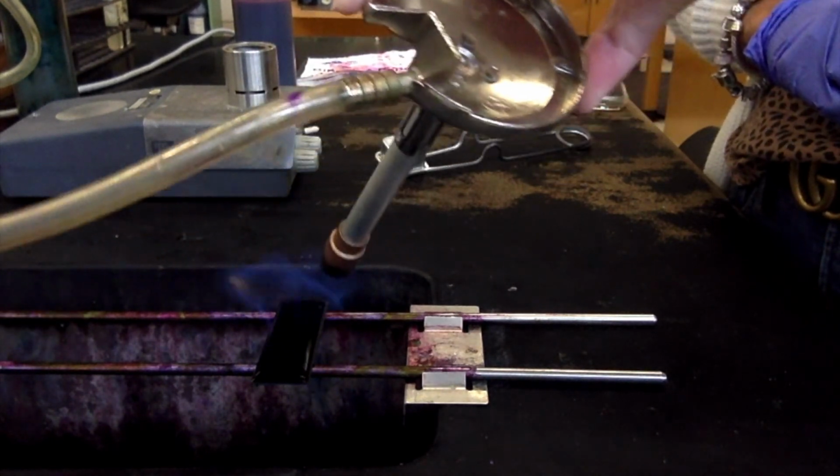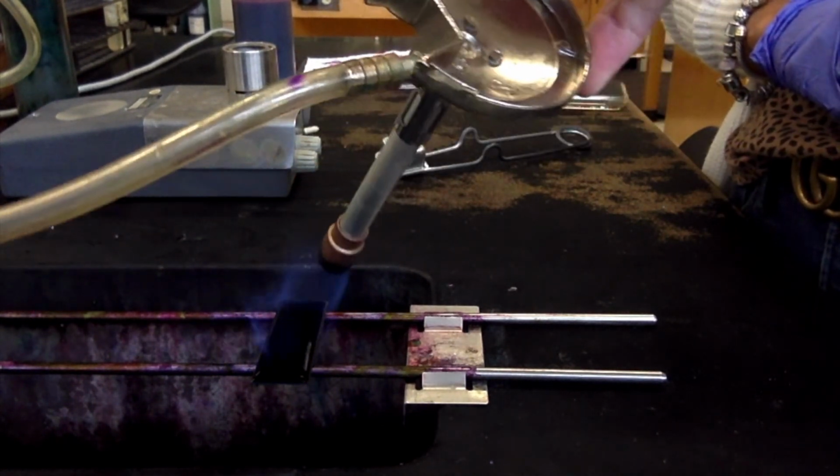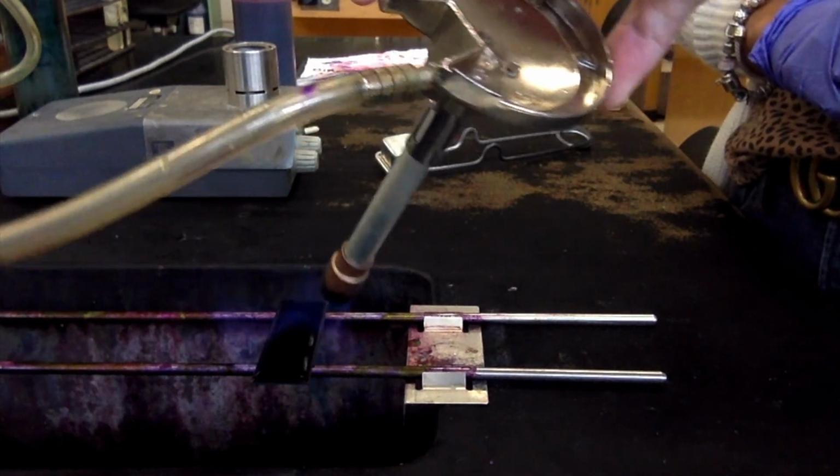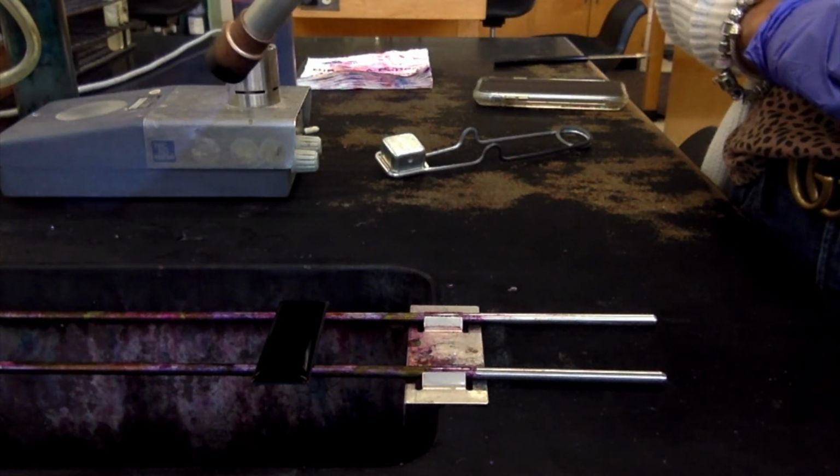We don't want to boil it. We don't want to cook it. We want it to steam. So what I'll do is I'll apply this until it starts to steam. Then I'll let go, let it steam a little bit.